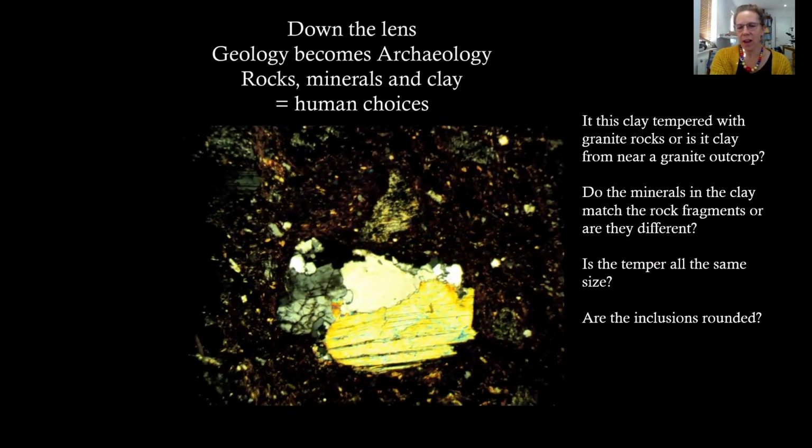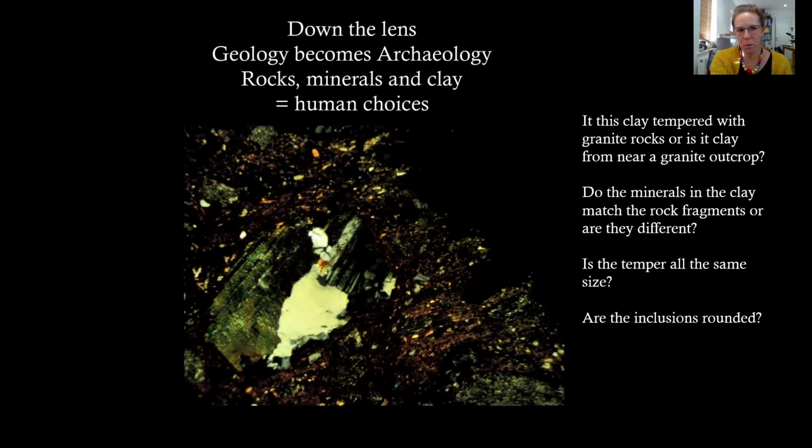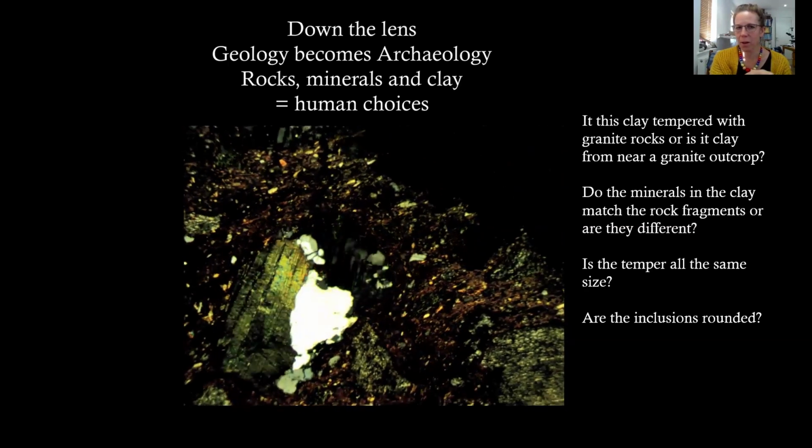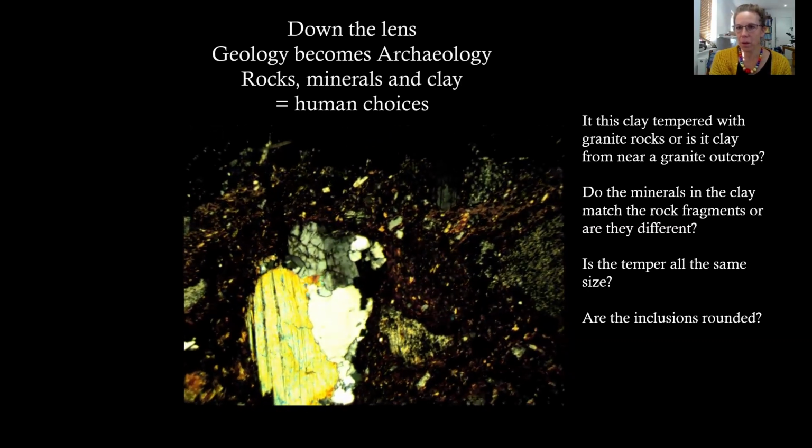And then the yellow stripy one there is muscovite mica, and it always has the colours yellow, electric pink, blue, and it always goes in and out of extinction, changes colour slightly, and so you know that's muscovite mica. And to the side, if you could play it again, Emily, that'd be really good. So to the side, you can see the black and white stripy one that goes in and out, black and white, and that mineral is feldspar, plagioclase feldspar.